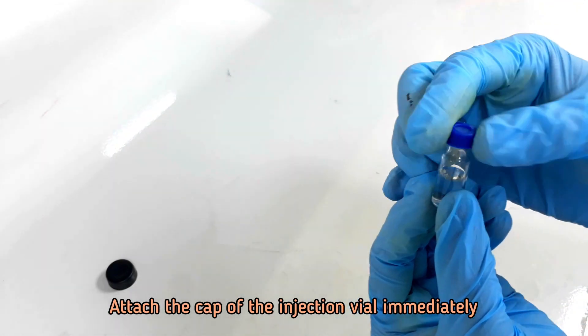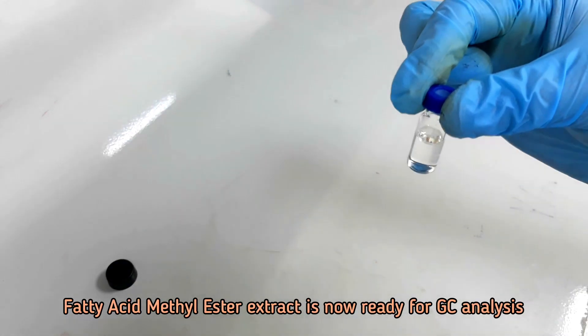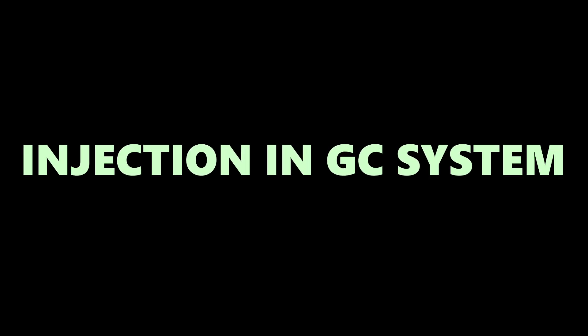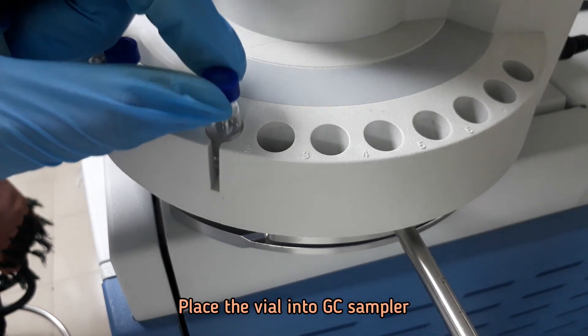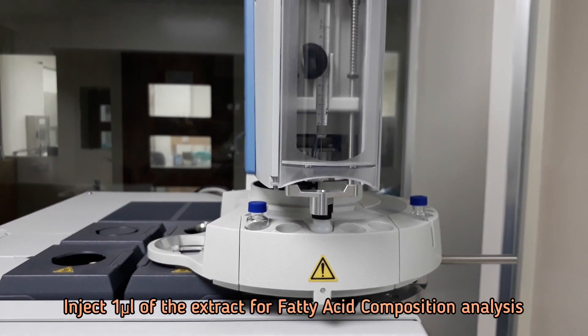Attach the cap of the injection vial immediately. Place the vial into GC sampler and inject 1 microliter of the extract in GC for fatty acid composition analysis.